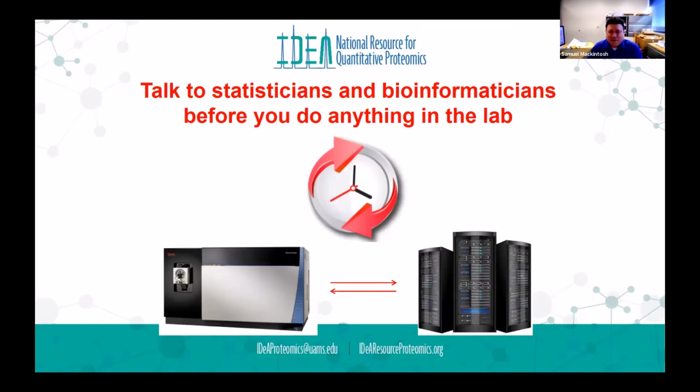But the trend here so far is to have a conversation about all of this before anything happens. One of the first things we like to do when we talk to somebody we've not worked with before is to schedule a meeting. We used to do conference calls, but now it's all on Zoom. We want to have a meeting with the biologists, the people who are going to do the work in the lab, the mass spectrometrists, and the bioinformaticists, so that everything, to the extent it can be, is designed up front.